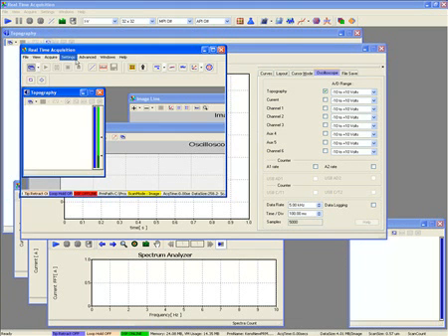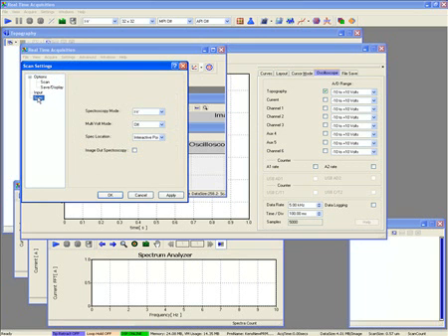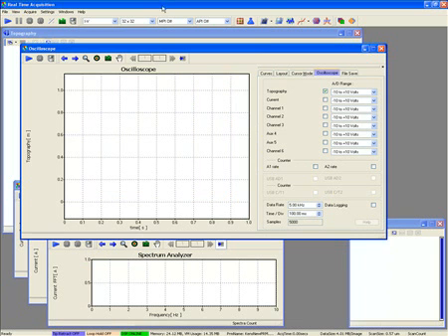Previously, these controls were somewhat hidden under the scan setting options. So we've moved these settings to the main toolbar, so there's never any confusion as to which spectroscopy mode you will be running. We've also moved our multi-parameter imaging control and our automatic parameter incrementing controls to the main toolbar as well.